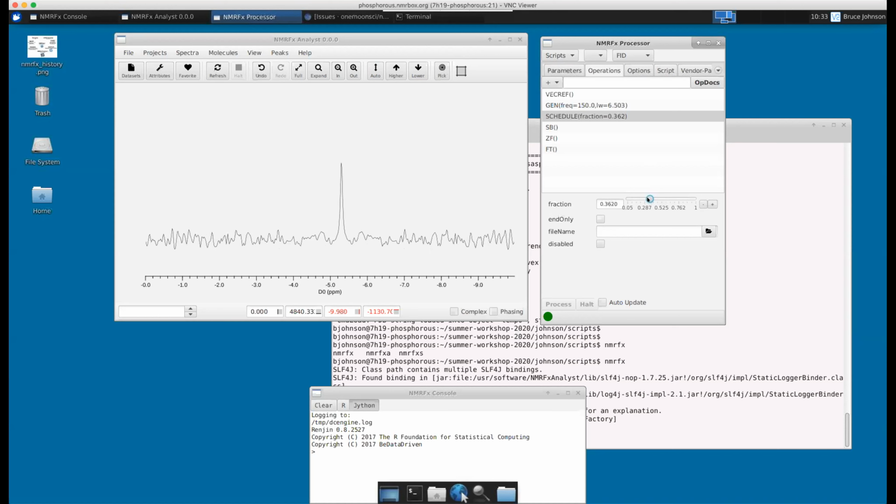So it's not simply a matter that we're adding noise, we're actually losing signal here, and it may have been talked about at the last session, the so-called point spread function. What we're actually doing by the sampling schedule, the missing points, is spreading data from this core signal out into different frequency bins. So the signal is simultaneously going down where we're adding this noise, and in that sense it's not really noise, it's actually signal that we wish was here at the actual frequency of our signal, but is getting displaced out into other parts of the spectrum.